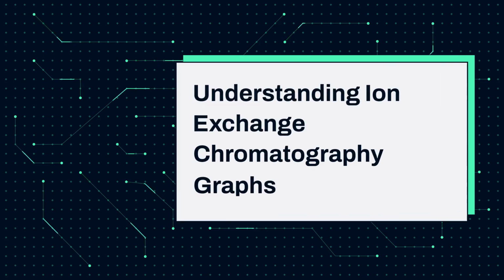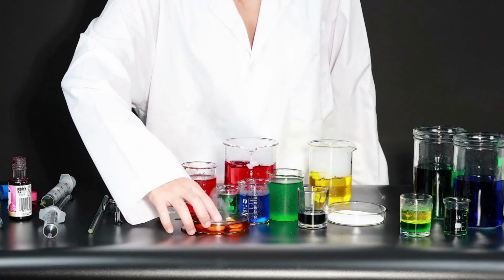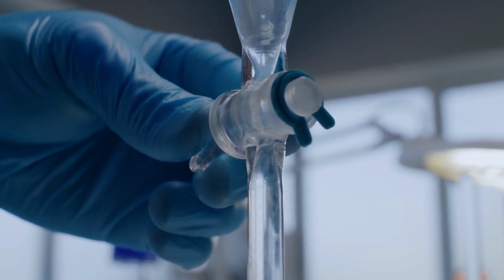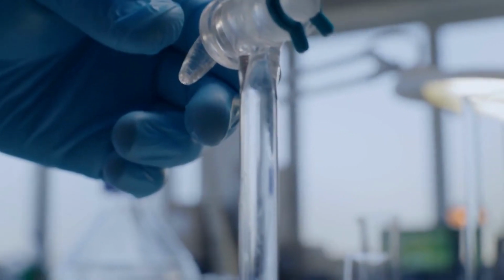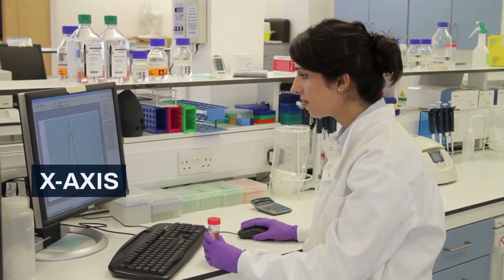Hello everyone. Today, we're going to make sense of ion exchange chromatography graphs. These graphs might look complex at first, but understanding them is quite straightforward. We'll break down each part so you can read them easily and understand what your separation experiment is telling you. Let's start with the basics of any chromatography graph.